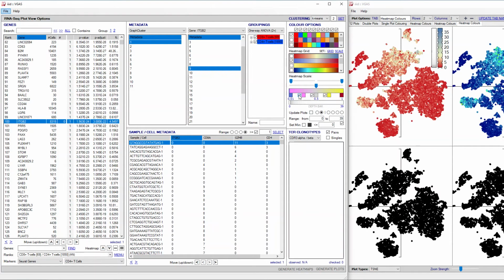A minimum scale value can also be set, with anything equal or below that value appearing in a selected color on the plot. So anything equal or below 0 would appear as gray. A range can also be set for metadata expression. Once changing a scale, users can also set the scale and save it in the grid.